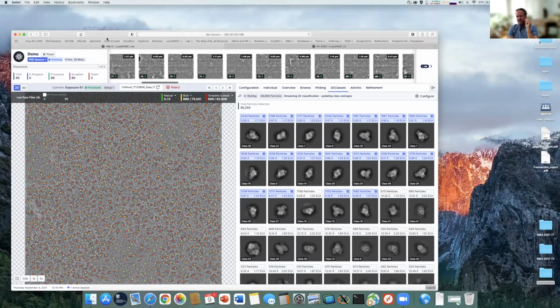Unfortunately, it's still rather challenging to move from cryoSPARC to RELION. Will the outputs from cryoSPARC be able to be taken into RELION? Yes and no. There are tools for cross compatibility, but people still have challenges in that space. And I think the two developers maybe don't sync up very well. It's a future challenge. That's all right. Yes, exactly.